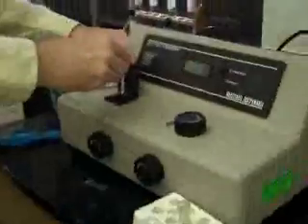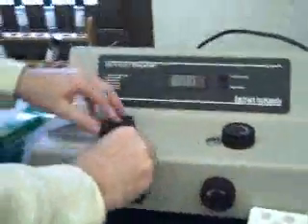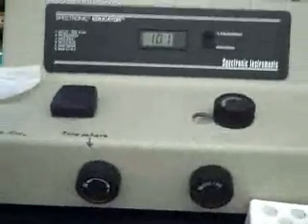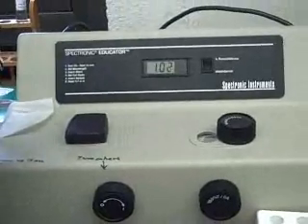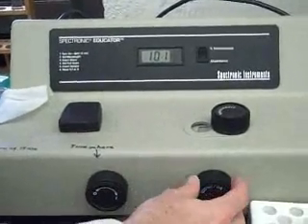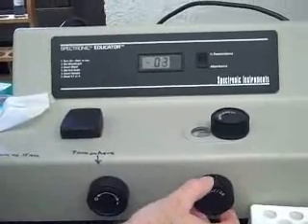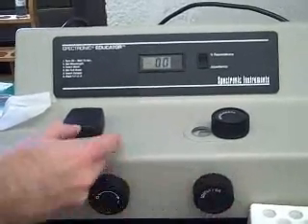So all we did was we cleaned off our tube, we inserted it in here, and we changed the wavelength of light. First one was 400. So 400 wavelength is purple light. So I'm going to turn this dial and zero it out. So now I'm subtracting the absorbance of petroleum ether in the glass. So it's at 0. Pull it out.